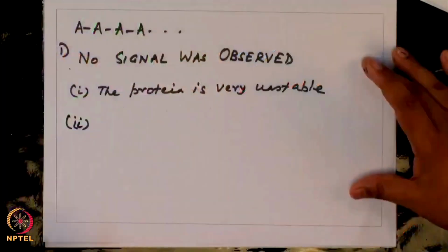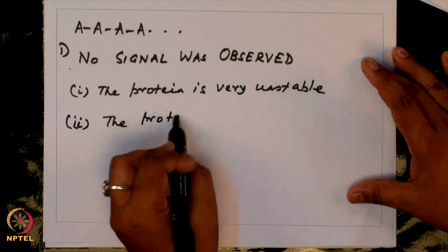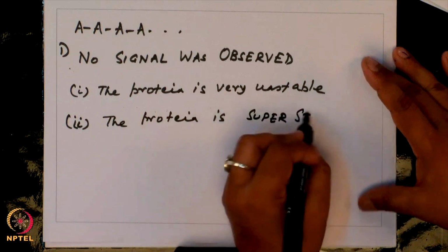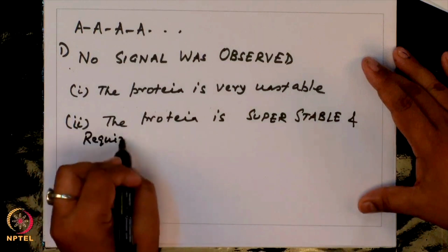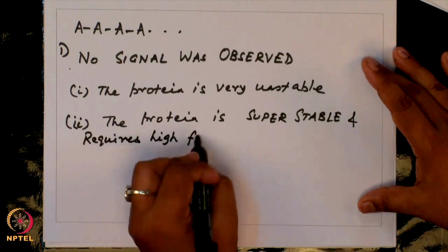What might be another possibility? The protein is super stable and requires high forces to unfold.